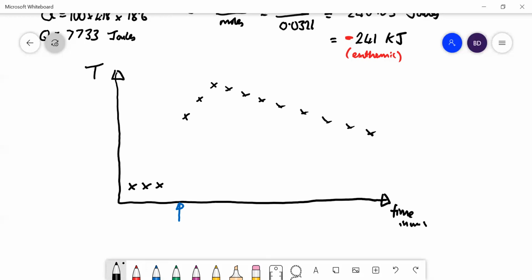Okay. Now, what two lines are we going to plot here? Well, first of all, we plot this one forward. This is the temperature before you've added the stuff. You plot that forward, yeah. And then we plot a line here, and the line we plot is actually that. Okay. So what we're saying is we ignore these points here because here the stuff is still reacting.